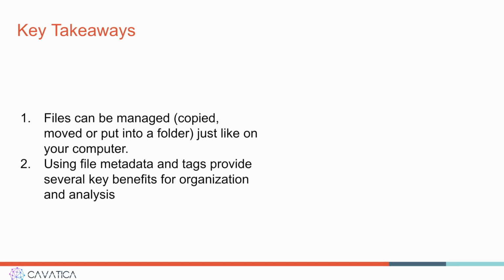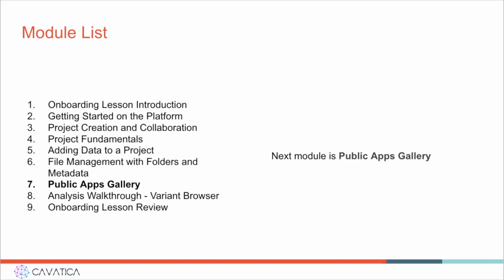Remember docs.cavatica.org for the CAVATICA Knowledge Center, which has further documentation on all of these features.